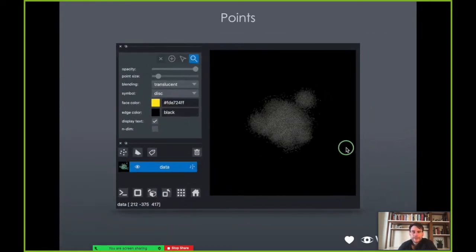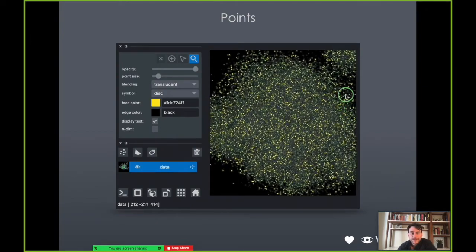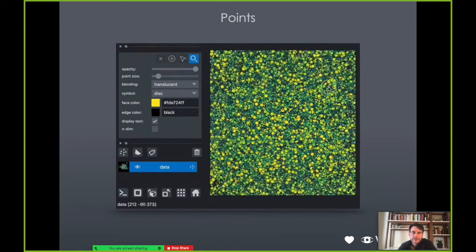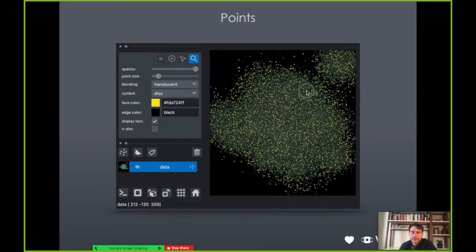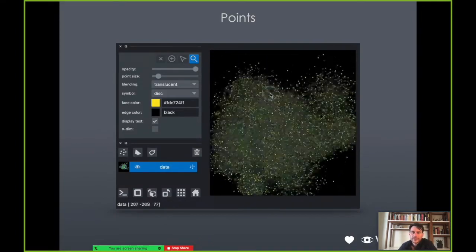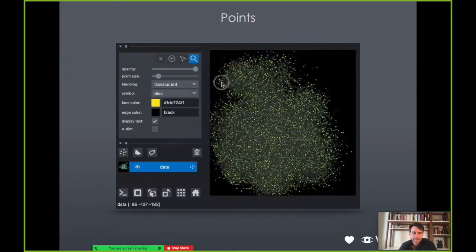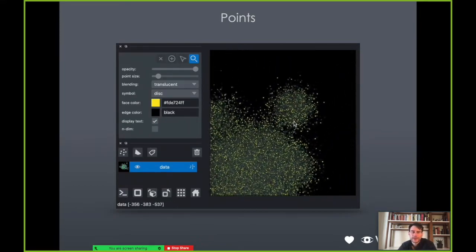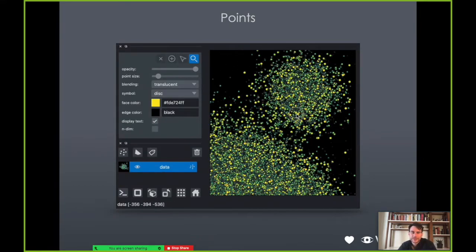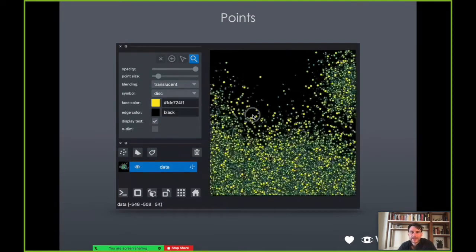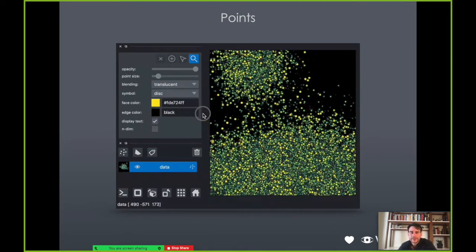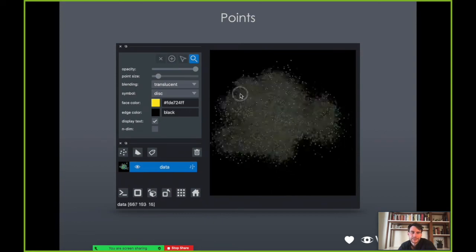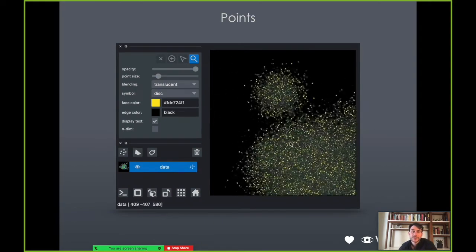Another fundamental layer type is points. We can scale to millions and hundreds of millions of points. This is a point cloud here in 3D, with points individually colorable and editable as well. This really uses the advanced scene graph and rendering capabilities of VisPy to make this highly performant, with rendering happening on the graphics card.